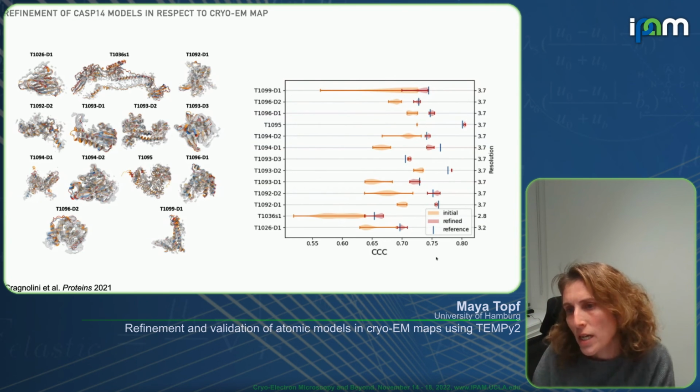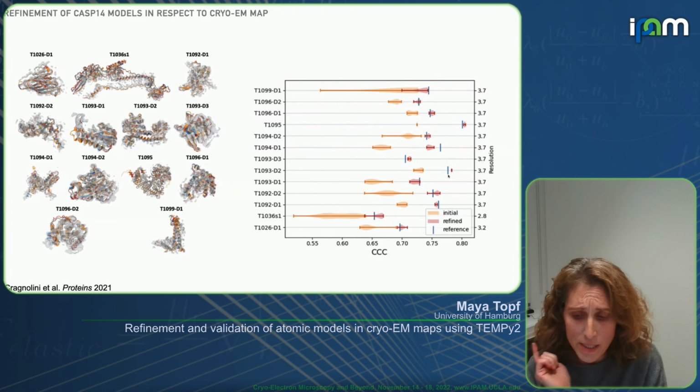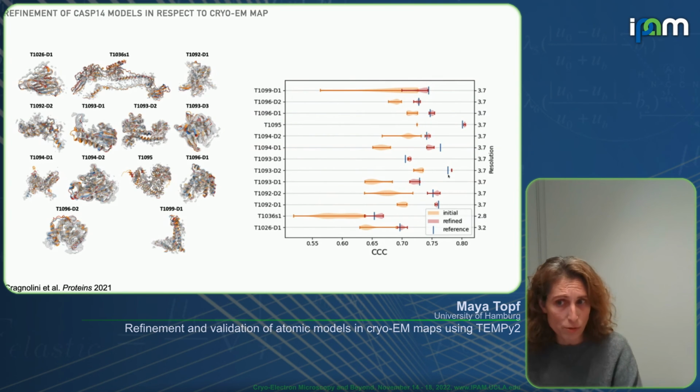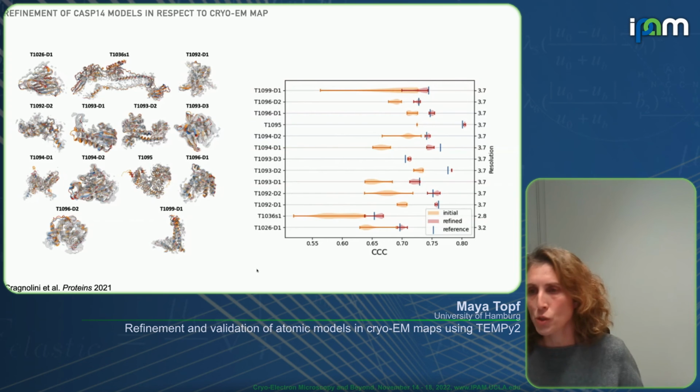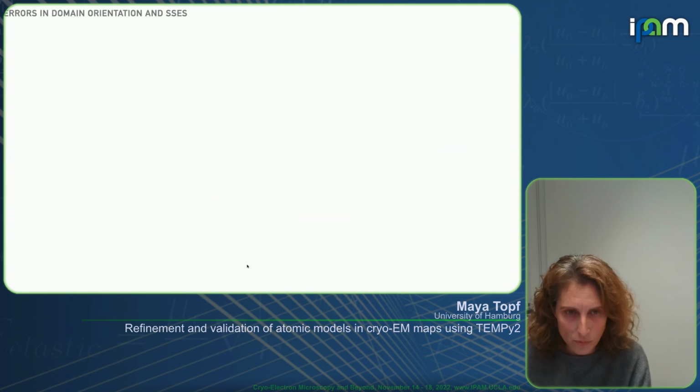But you see that actually, in some cases, our best refined structure is better than the reference structure. Now, the initial models are actually models coming from CASP. In most cases, it was AlphaFold, but it wasn't all the cases, because AlphaFold didn't participate in every target. So I don't know which one is which here, but all I'm saying is that having really, really accurate structure prediction models can sometimes result in a better final refined model than just using less good approaches for modeling.